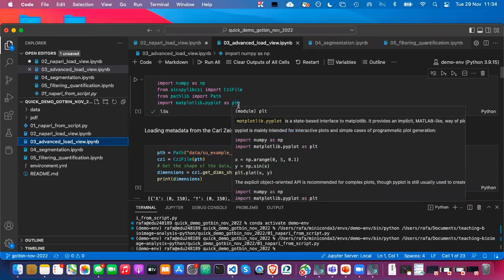That's a very common way that I work: I usually don't use Napari all the time. I use it to explore a data set. Then I do a bunch of operations, and after all those transformations, I might want to explore it again. But also, things such as matplotlib or even skimage have very basic image plotting, so you can just look at your images as you work with them.